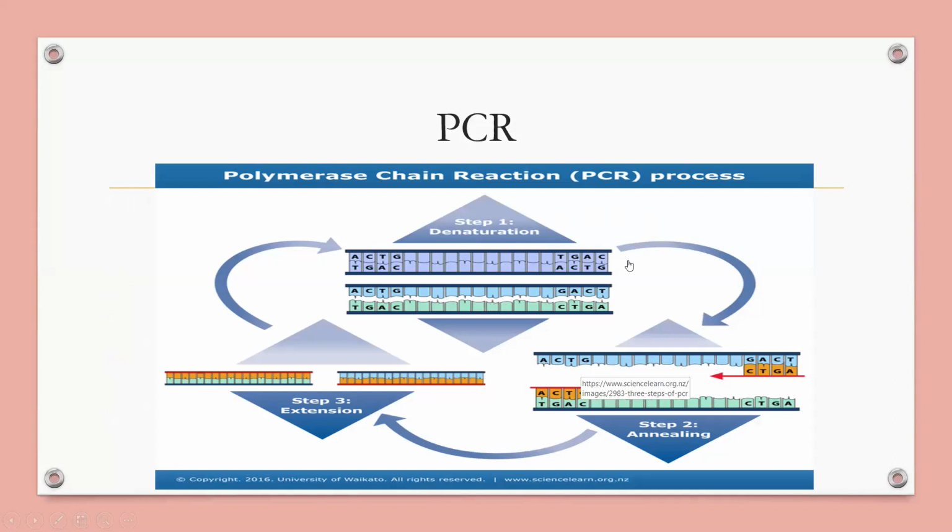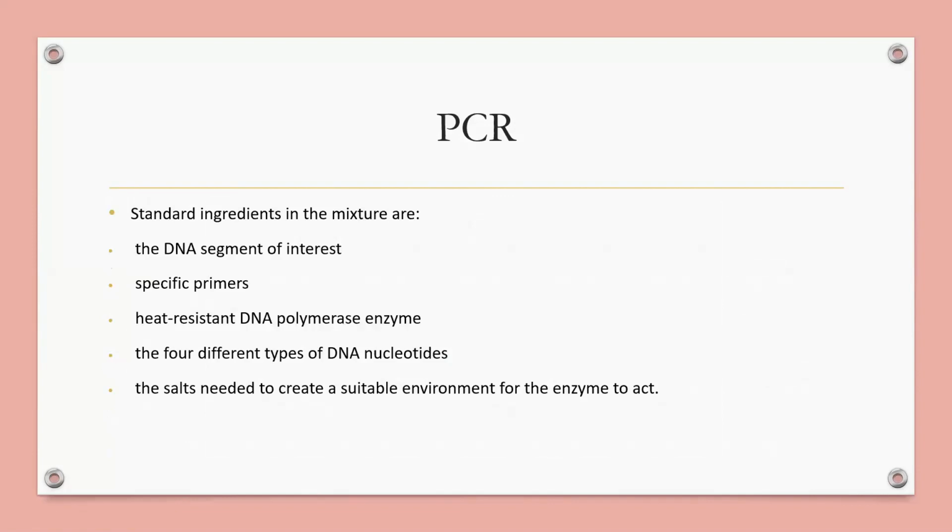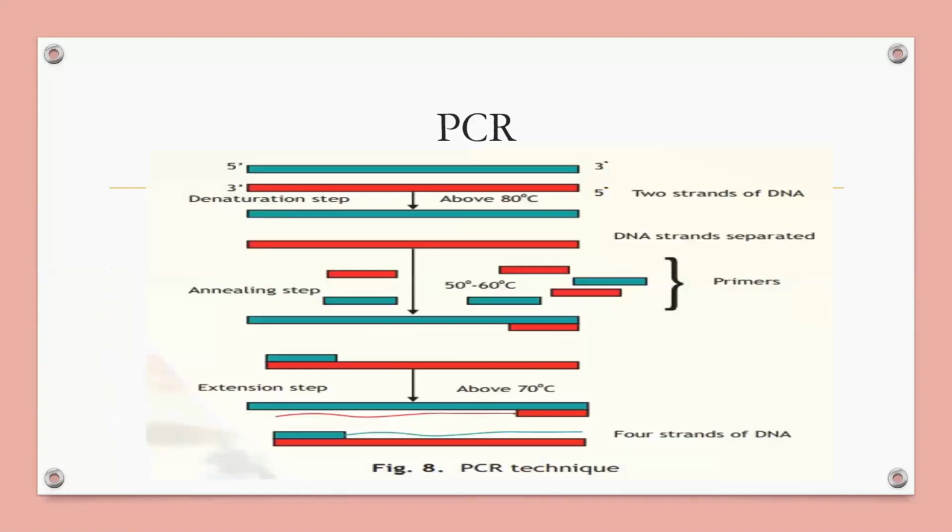Okay. Do you understand? Next, step two, renaturation or annealing. Okay. Look at here. First step is done.